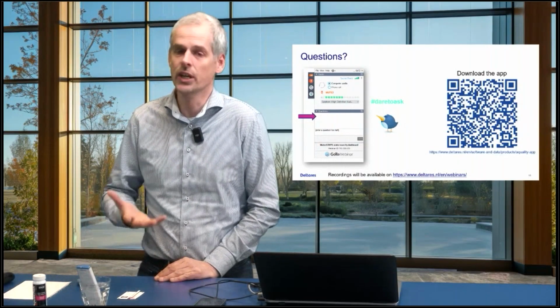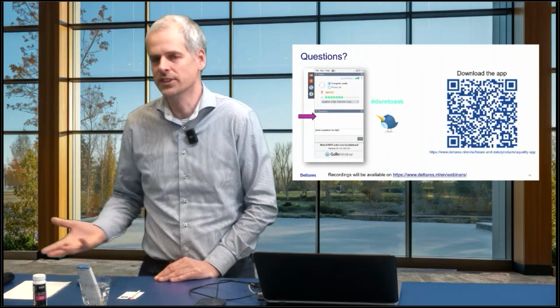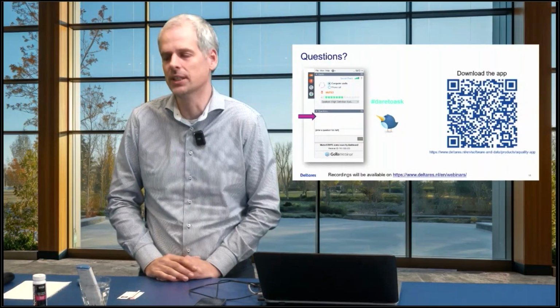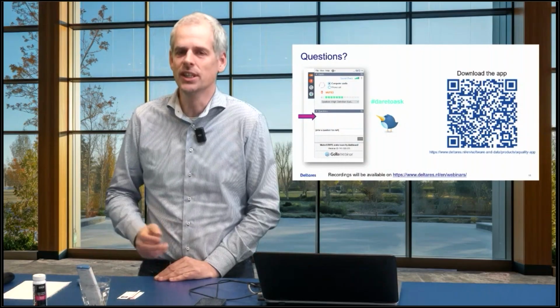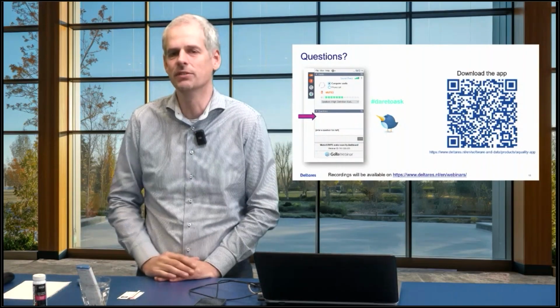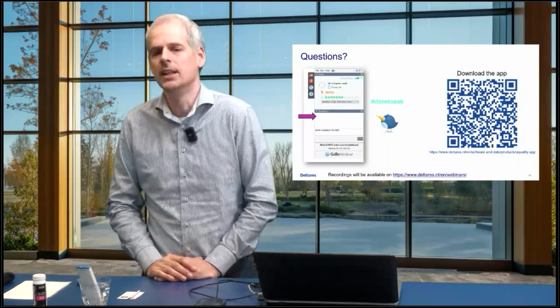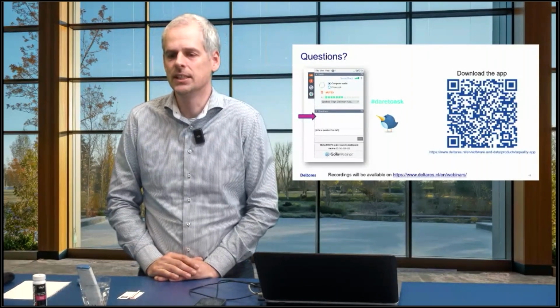Also if you have your own salinity measurement device or your own phosphorus ammonium device, you can also use that and use the manual input to store those data. But be aware that you use the correct units. Especially salinity can go in different units like milli or microsiemens per meter or centimeter. But also for phosphorus and ammonium, you have to check that.